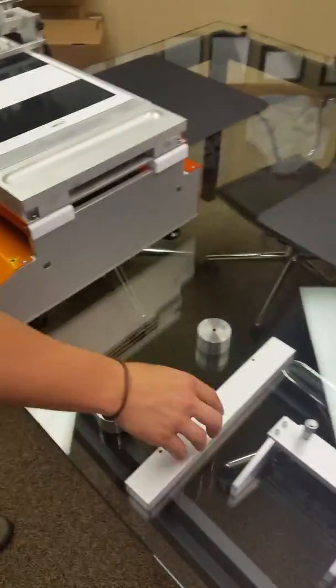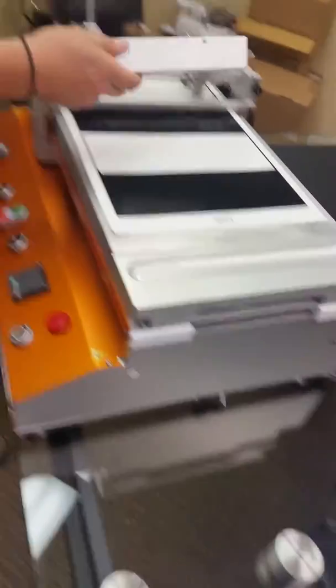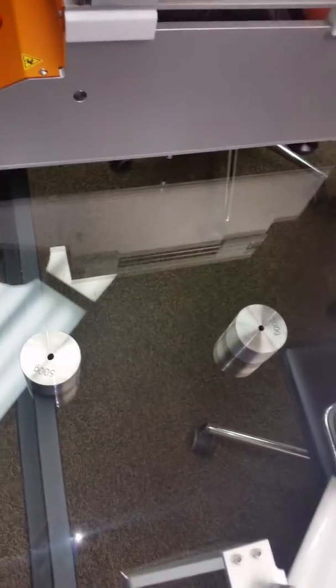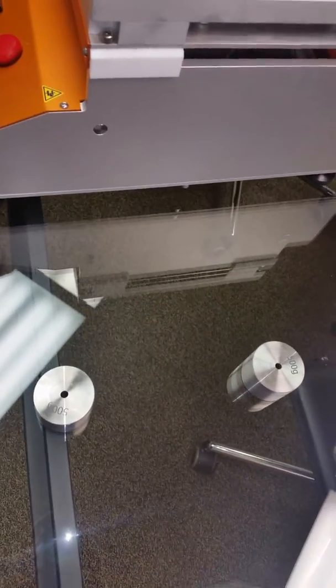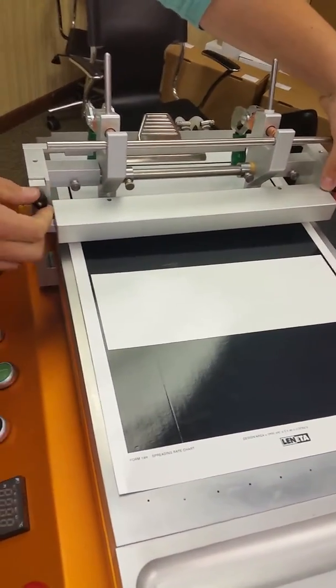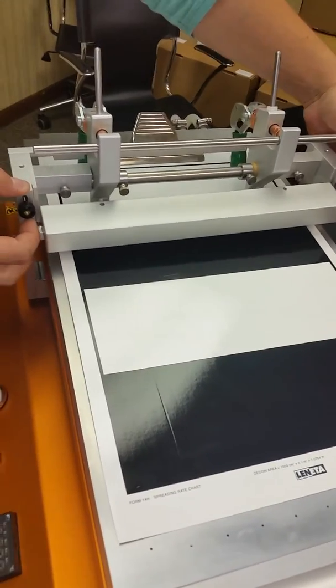Now you take the weight. It comes with two style weights. You have the bar weight and you have the round weights. The round weights are used for the spiral bar applicators. The bar weight is used for the Baker film applicators and any type of film bar.